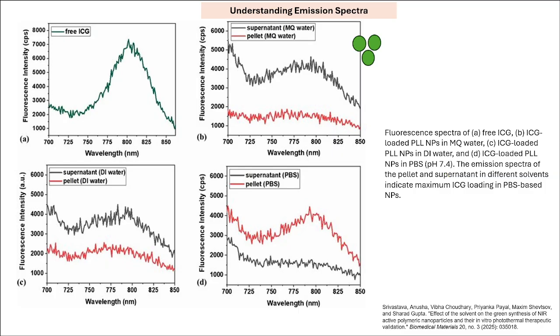Now moving forward, for the same thing, when we see the emission spectra, this is also from that paper only. So this is the free fluorophore, free ICG, which shows emission at 800 nanometer. Now the absorption of this particular compound was at 780, but the emission is at 800. So that's what we were discussing in the initial slides, that the emission wavelength is always a little redshifted.